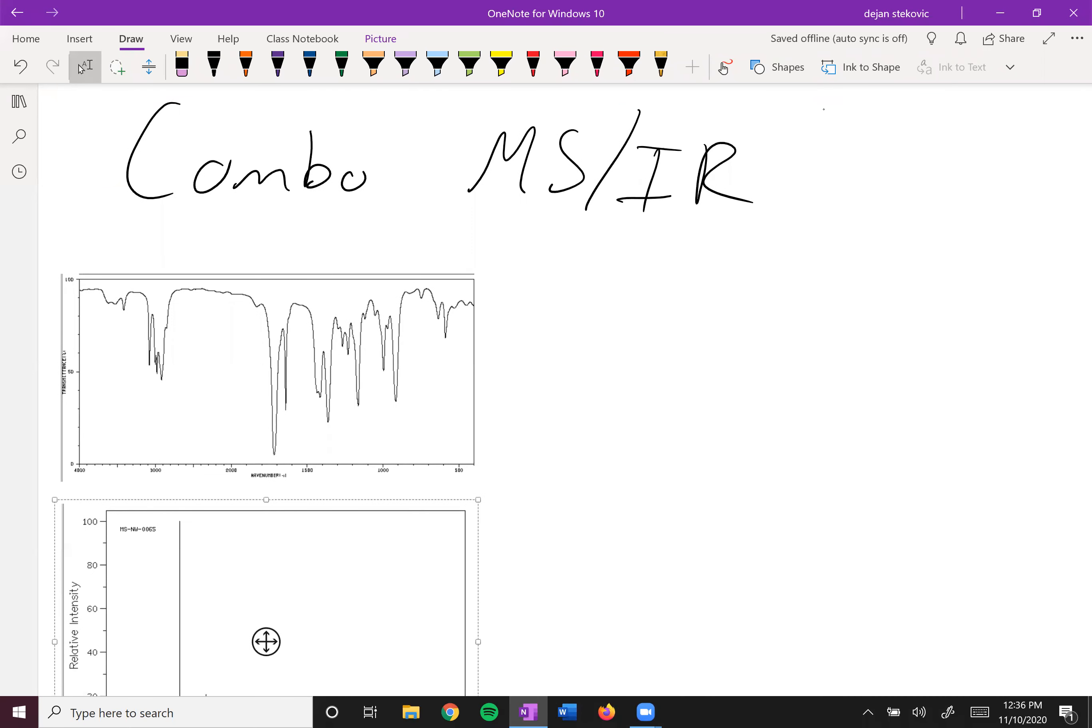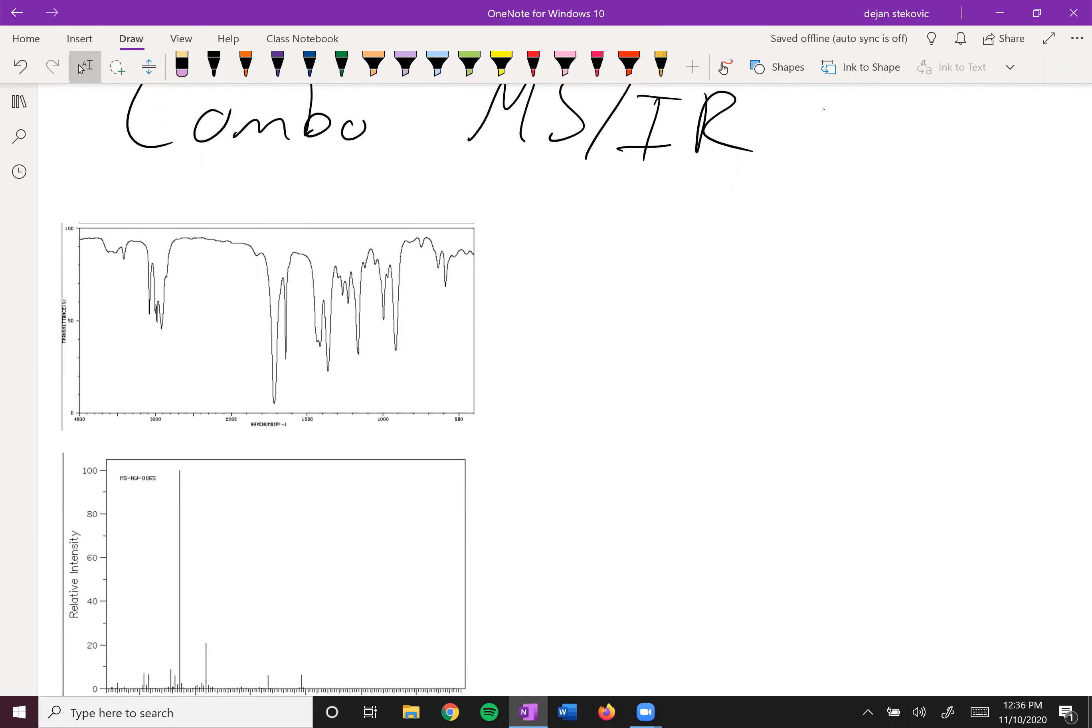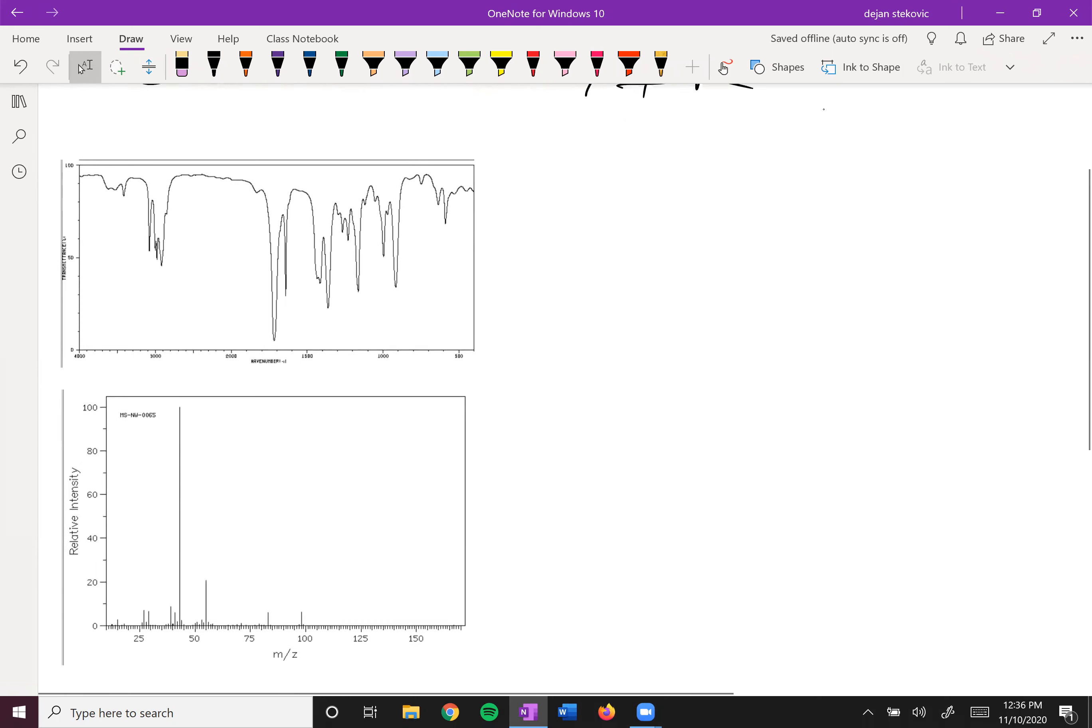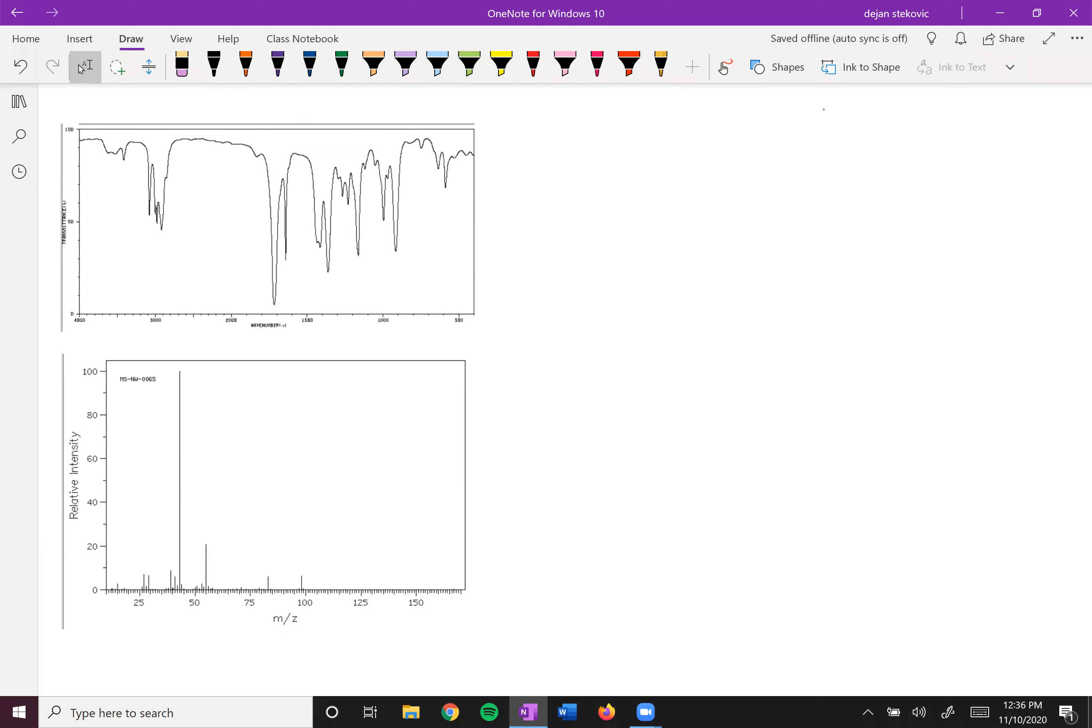All right, so remember our actual goal here is to identify the formula and structure of our compounds. A good place to start with this is to take a look at your mass spec and infrared spectrum and pull out information to limit the possibilities of what molecule it could be. Let's go ahead and take a look at this. These are from the same compound and let's see what data we can pull out.